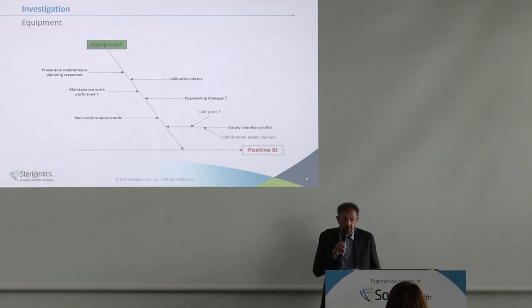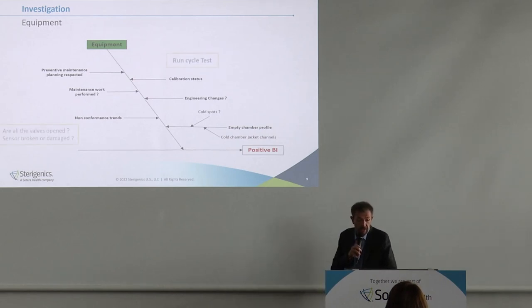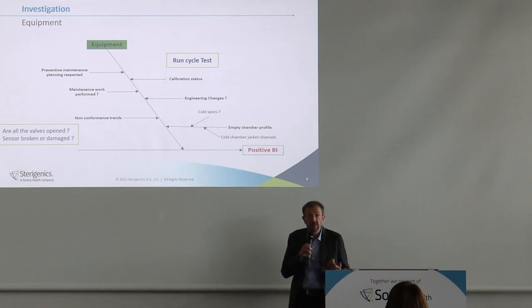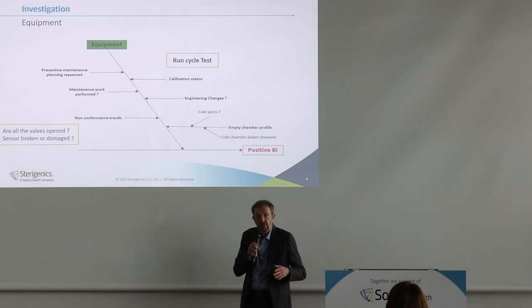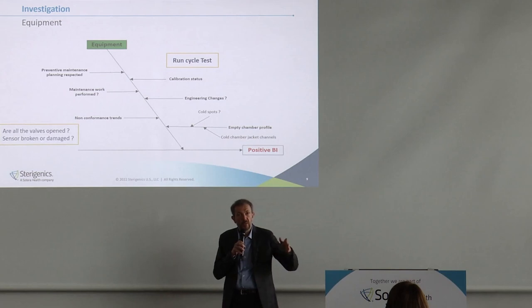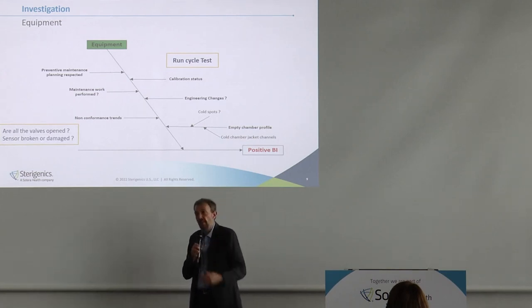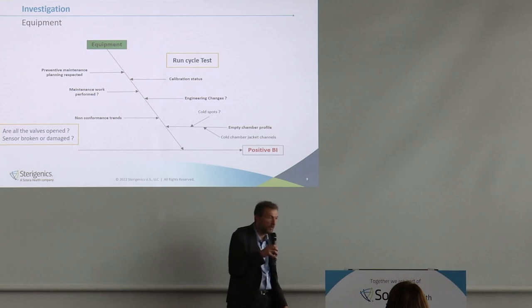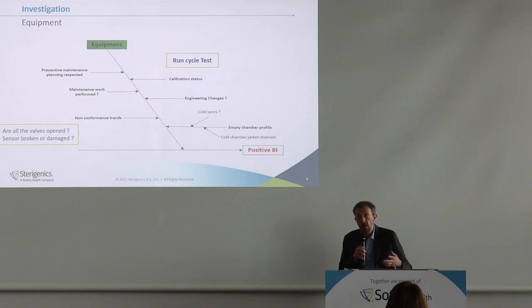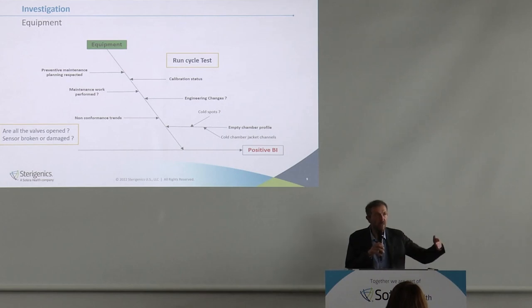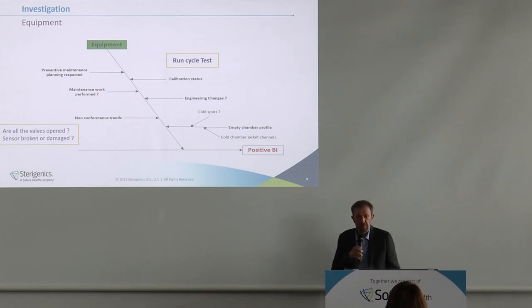The second aspect to consider is the equipment. We need to check if there was any maintenance or repair in the chamber that could change its behavior. We perform engineering test cycles to make sure the parameters delivered are the same as before, essentially repeating tests from the operational qualification to confirm that what was done initially is still being delivered.